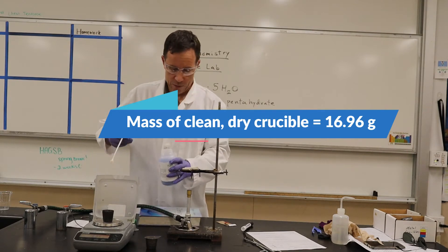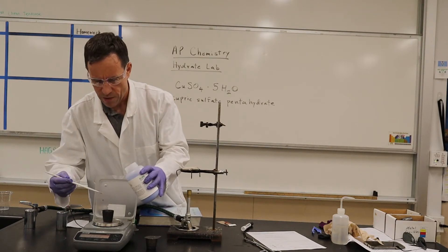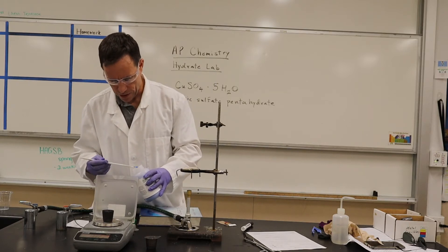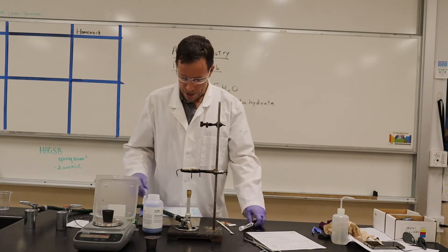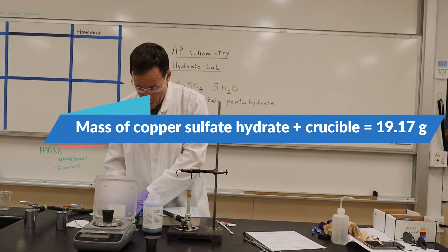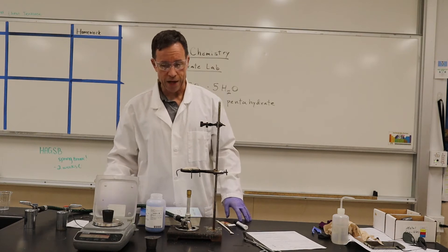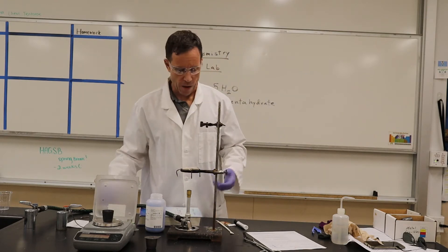Now I'm going to put some solid in there — a couple grams of it. We'll put about enough to bring it to around 19.17 grams. So if we needed to, we could figure out how much copper sulfate is in the crucible — we would just subtract the clean, dry crucible mass to get the mass of the copper sulfate.